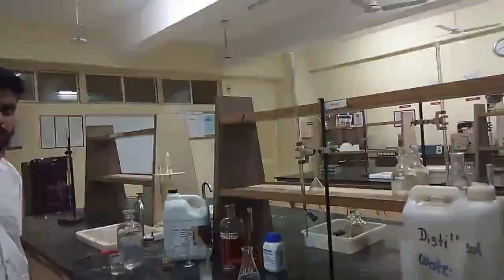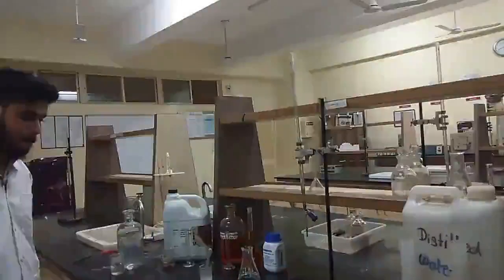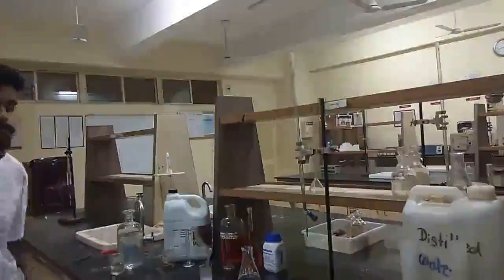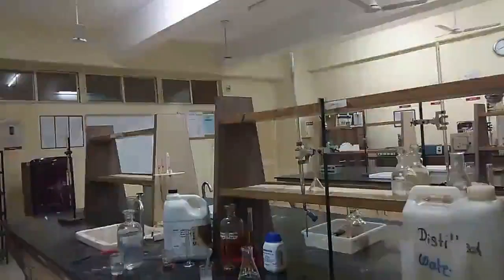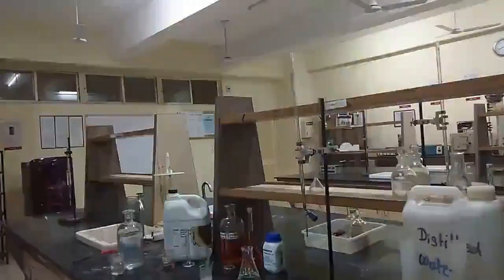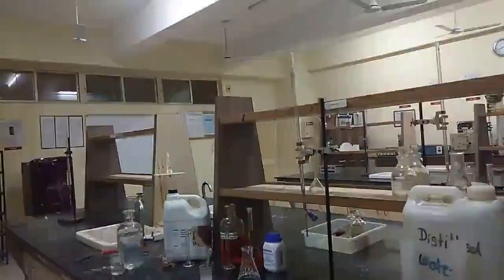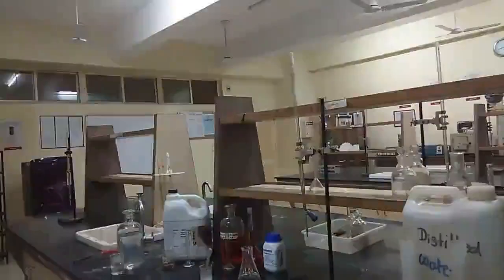Substituting the values, the normality of the titrant after doing the titration obtained is 0.0268, that is 0.027 normal. So we initially prepared the titrant of 0.025 normal, but due to some error it has come according to the titration process as 0.027, which is to be used finally to find out the DO of the sample.